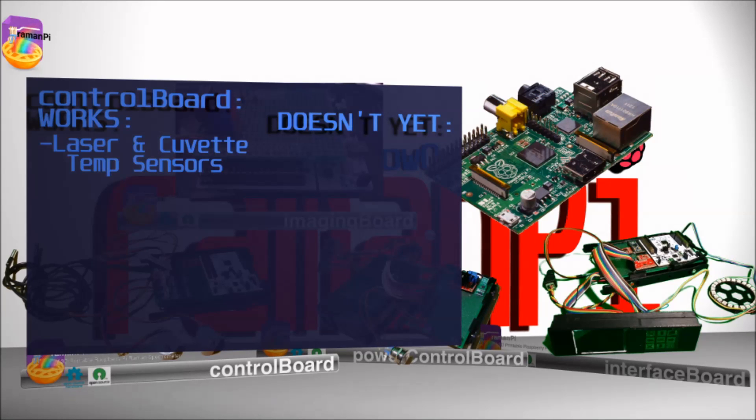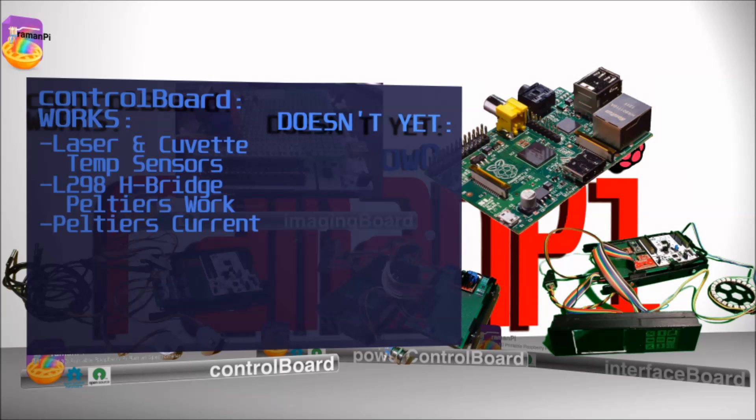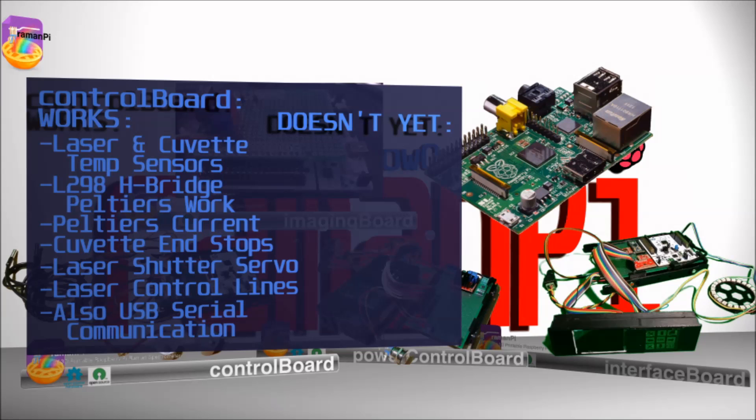Currently, the control board monitors the laser and cuvette temperatures via two DS18B20 sensors. It controls the L298H bridge, which drives two Peltier devices — one Peltier cools the CCD, and the other cools and heats the cuvette to maintain its temperature using a PID controller. It also monitors the current draw for both Peltiers, reads the cuvette end stops, controls the laser shutter servo, and both the TTL line and the power relay for the laser. The laser's TEMT6000 sensor, BMP180, and laser color sensor are currently on the back burner.